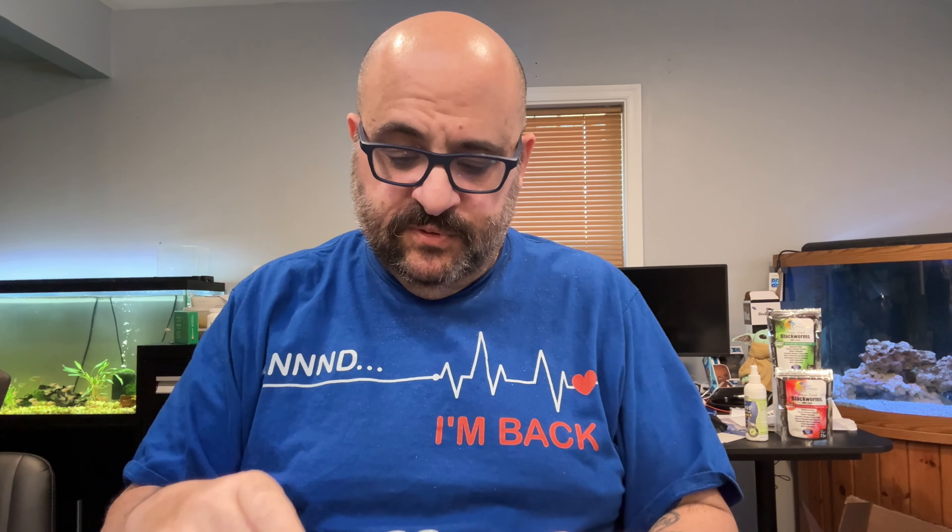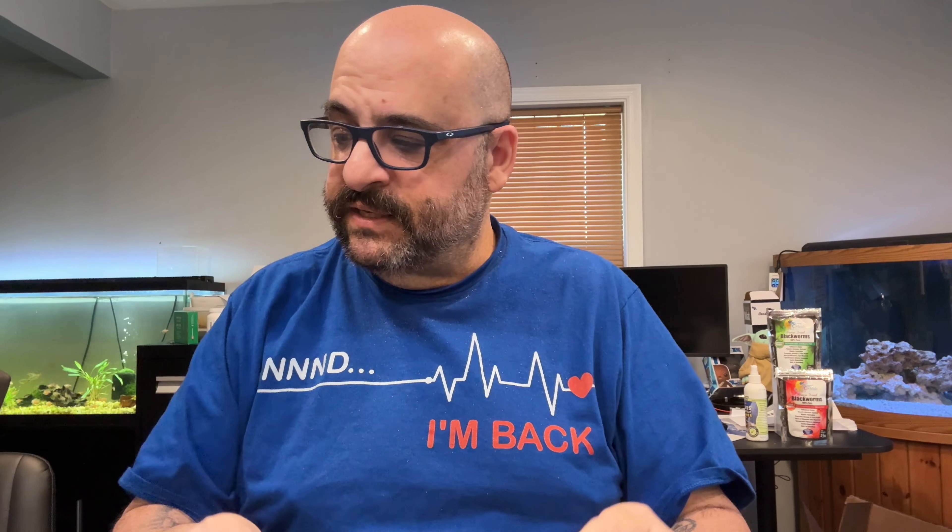There are differences between liquid tests and test strips. If you don't buy the right test strips they won't work; if you buy cheap ones they don't work; if you leave them open to humidity they fail quickly. Some people claim the ammonia test isn't accurate and you need a separate strip for that. A lot of people say the nitrite test isn't accurate and always reads low. I've never had that problem — I've always used them according to directions and kept the lid tight. Just because social media says test strips are crap doesn't mean they are.